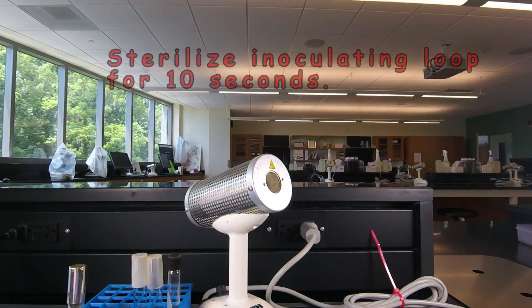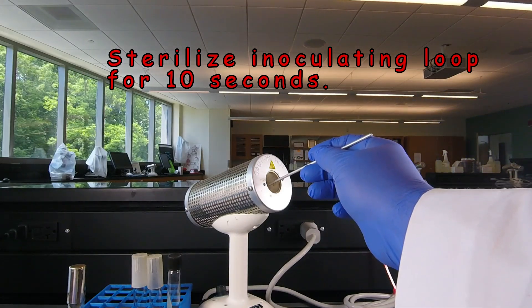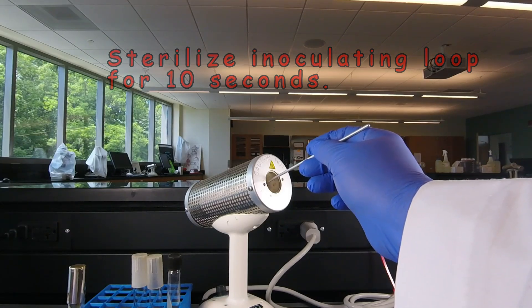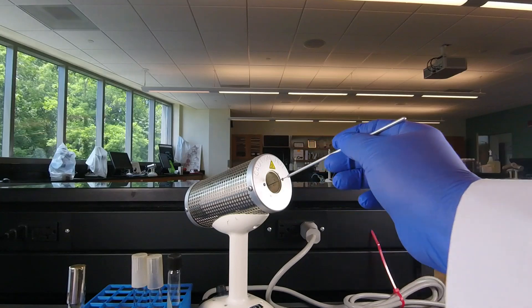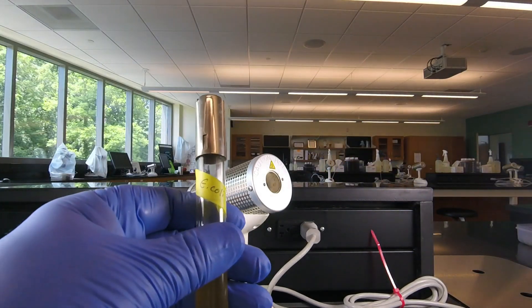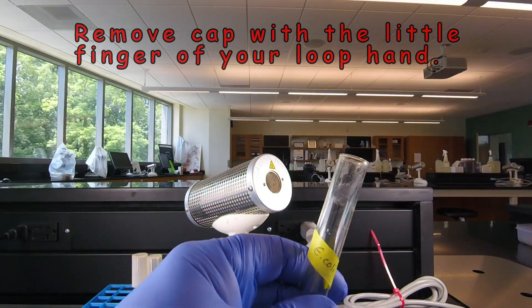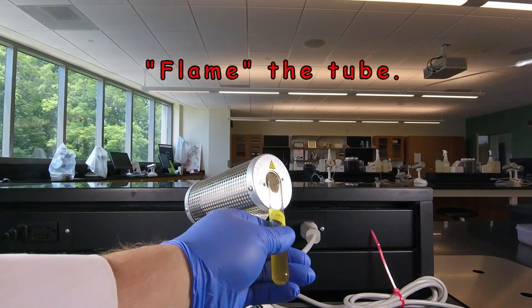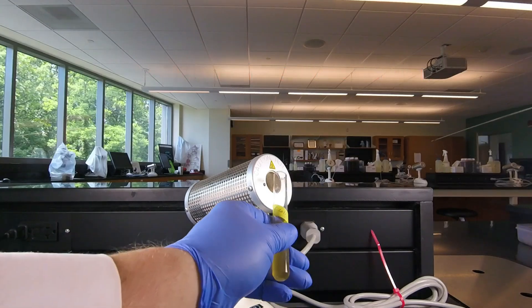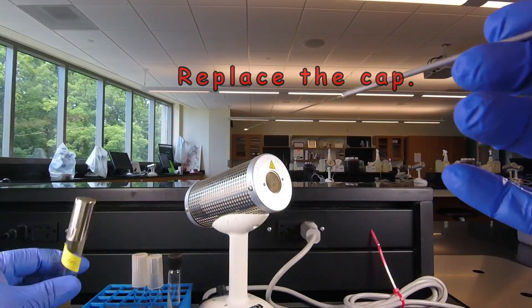We begin by sterilizing our inoculating loop in the back-to incinerator for 10 seconds. Then we pick up our pure culture of bacteria — in this case E. coli again — remove the cap with the little finger of the loop hand, flame the tube for three seconds, remove a loop full of E. coli, flame the tube for three seconds, replace the cap, and set it back down.